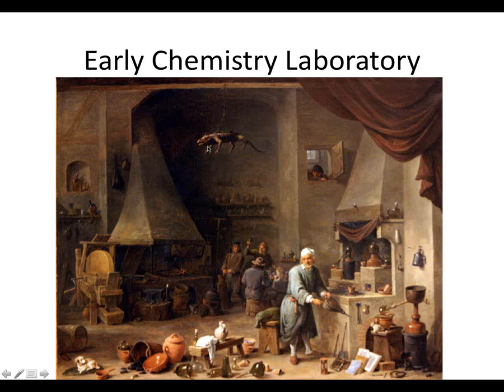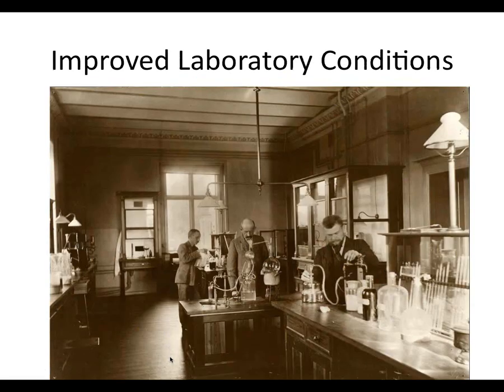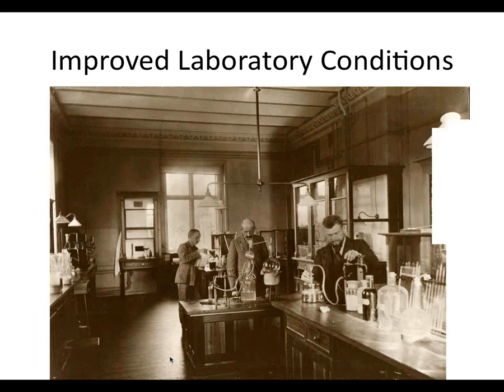But you also will notice, okay, we've got this animal, a vertebrate, hanging from the ceiling. It may be alive or not, but this is a serious IACUC violation, that's for sure. The Institutional Animal Care and Use Committee would have problems with this, and the dog in the laboratory. That's an issue as well. Right. So time moved on, and then about 100 years ago, laboratories looked like this, a much improved image of the laboratory, a lot more organization, but PPE is still not really present in these laboratories.